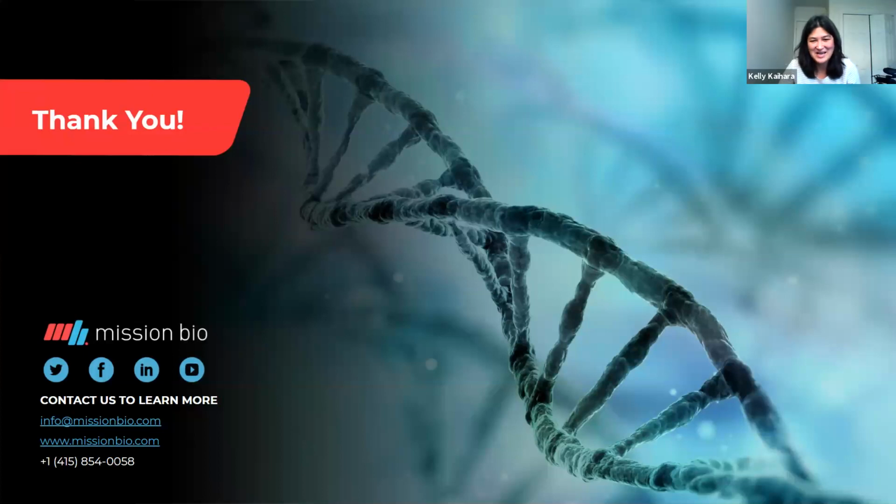And I'd like to add, we have a fantastic FAS team at Mission Bio. And the Jupyter Notebook, even someone with medium level skills in bioinformatics, Hem and I are able to easily execute the Jupyter Notebook and unlock these advanced analysis tools. So really, we support all levels of ability.